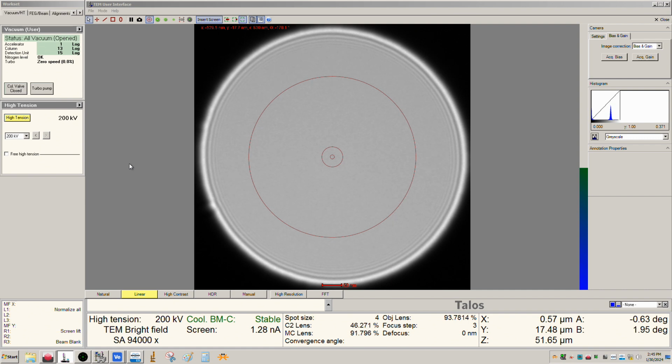But if we get enough of the point defects, what we can see is extended defects. If we get enough point defects, we can see things like stacking faults and dislocations. We may even eventually be able to see amorphization, because if we start with a perfect single crystal and we create enough point defects, we can end up with something that is not crystalline anymore, just amorphous.